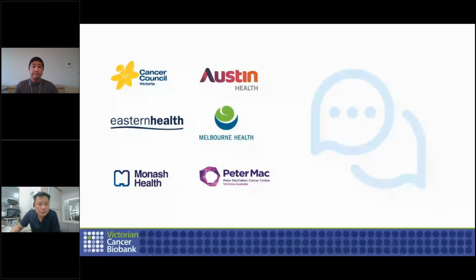Hi, thanks, Duncan. I'm Eng from Singapore. We do have a network of biobanks in Singapore as well, and we are working with Sri on implementing OpenSpecimen. So I have two questions for you. The first is that you mentioned clinical trial support by VCB using OpenSpecimen. Can you elaborate a little bit about how you support clinical trials?